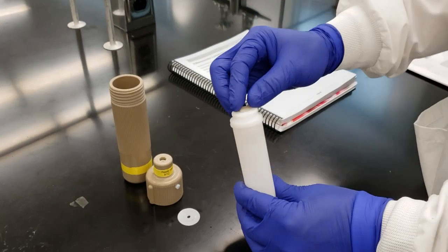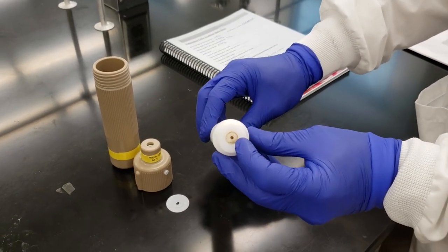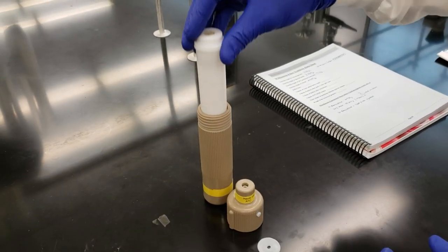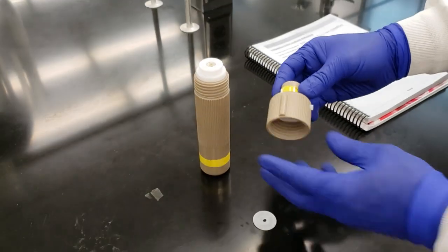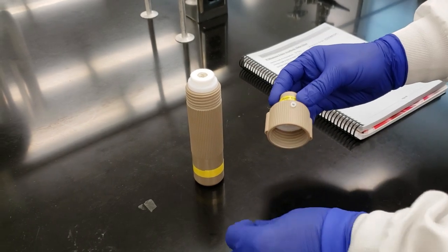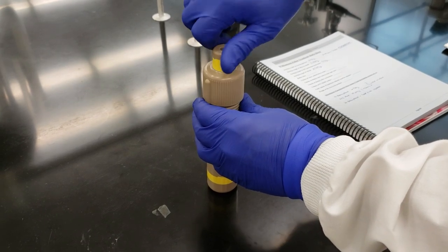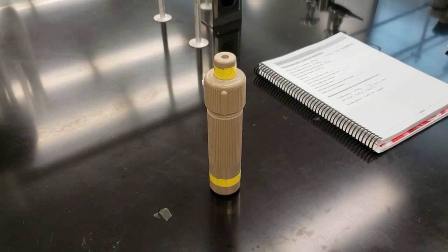We then place our thermal well in. This thermal well has a hole in the top. That's where our temperature probe is inserted so we can monitor the temperature of the reaction. The completed inner sleeve is then placed inside of a safety shield. The safety shield has a cap. This cap has a venting hole on it. This Teflon wafer is placed on top of our Teflon inner sleeve, and then we screw down the top of our safety shield, and it's ready to be placed in the microwave.